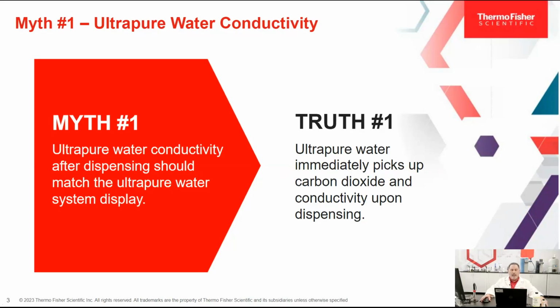The truth is that ultra-pure water immediately starts to pick up carbon dioxide and the conductivity starts to rise right when dispensing. So dispensed ultra-pure water will read a resistivity lower than 18.2 and a conductivity higher than 0.055 microsiemens.